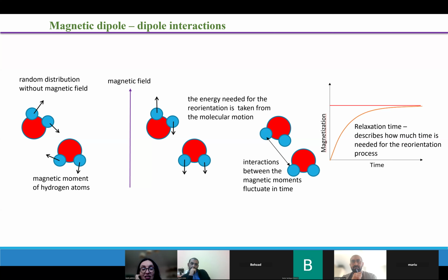This is again a stochastic process. Just like the translation diffusion is changing position by a very, very small step, when we reach the level of derivatives and differentiation and so on, here the molecule changes its orientation by a very small angle.